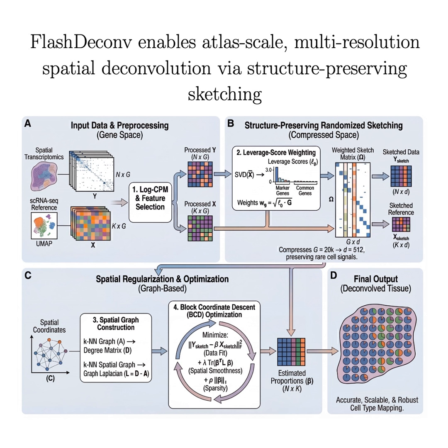It's the perfect storm. It's a structure that's both mathematically quiet in the gene space and spatially diluted at low resolution. You needed both the speed and the feature selection of FlashDeconv to make this discovery. This is really the definitive story of how data science can literally clarify biological reality. FlashDeconv used this mathematical principle, distinctiveness over abundance, to save these rare critical signals, enabling this linear scalability to massive million-spot atlases. And that ability to process data this quickly totally transforms resolution selection.